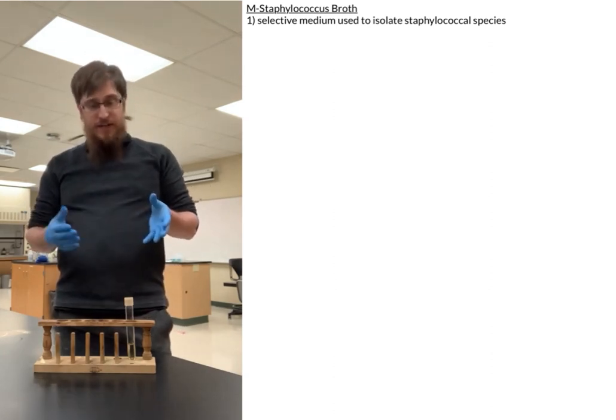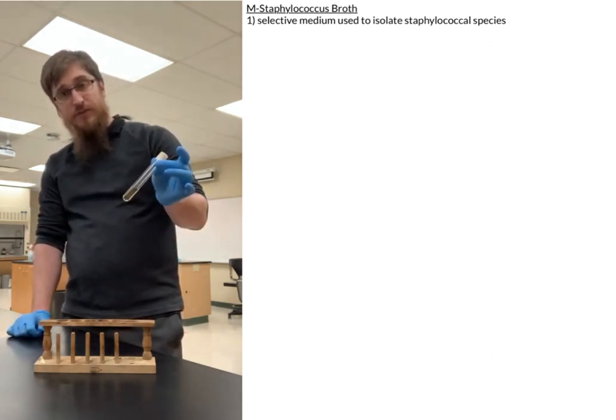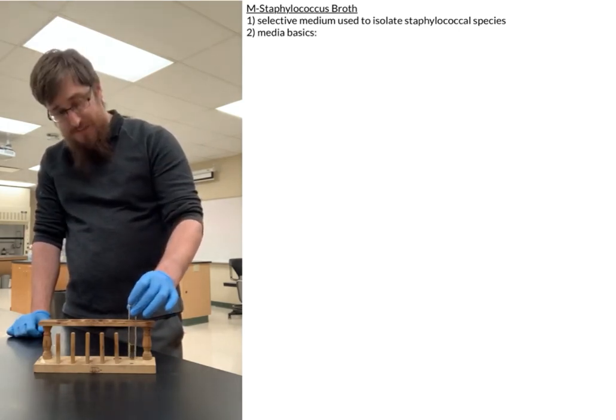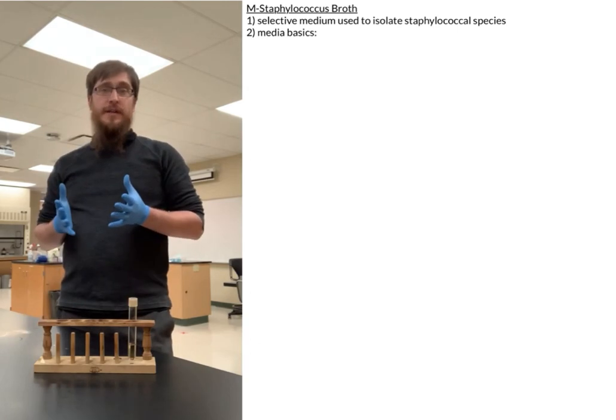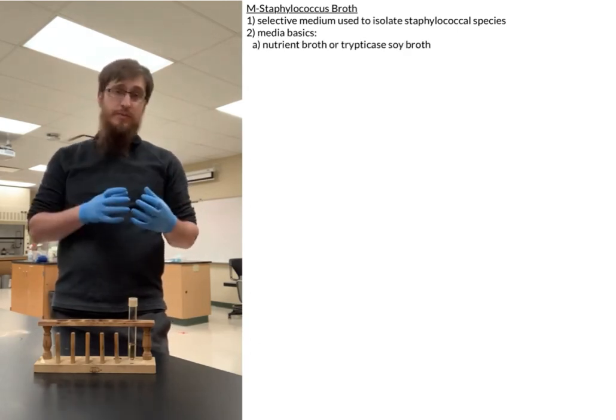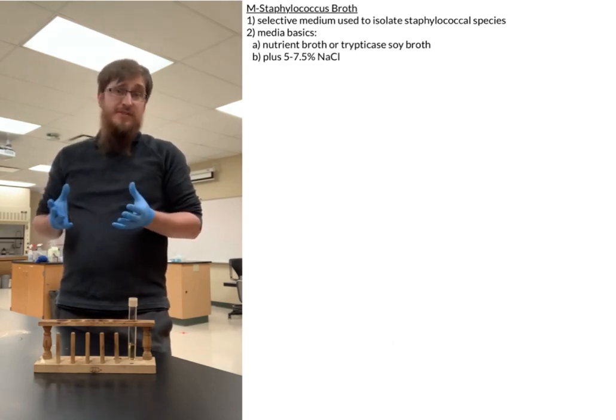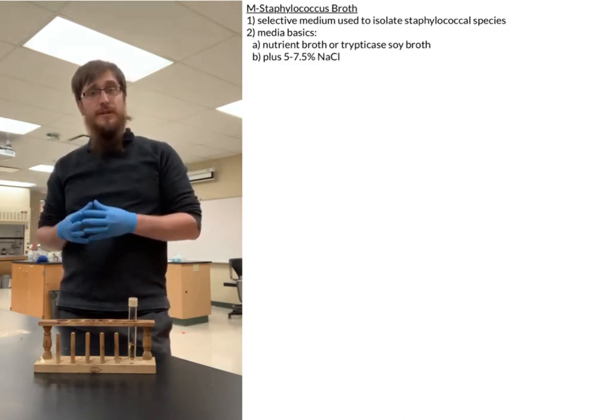And looking at the media, you might say this looks fairly similar to our basic growth media, and that's because it basically is. So M-Staphylococcal broth is where we take something like a nutrient broth or a tryptic soy broth, and we just add 5 to 7.5% sodium chloride to it.